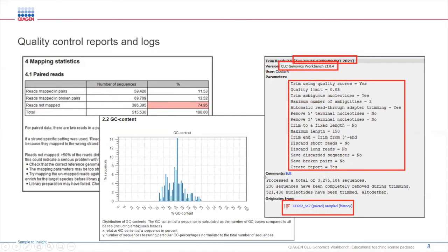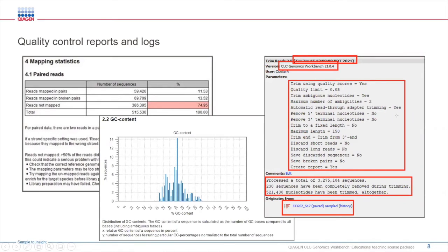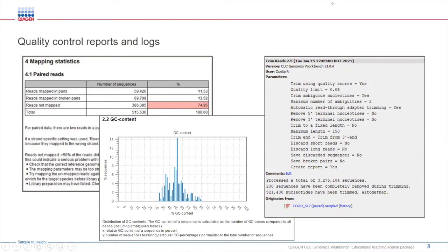You can also add additional comments to the log to give you reminders of what exactly was done or why you did this analysis in the first place. This log is saved with every process, so if you happen to transfer your files to someone else, they can see this log and look at what was done as well.